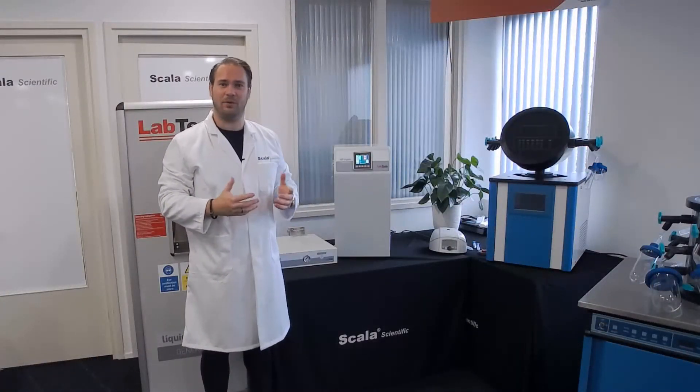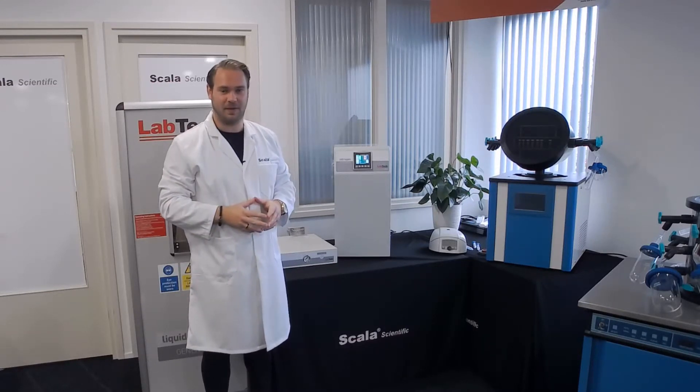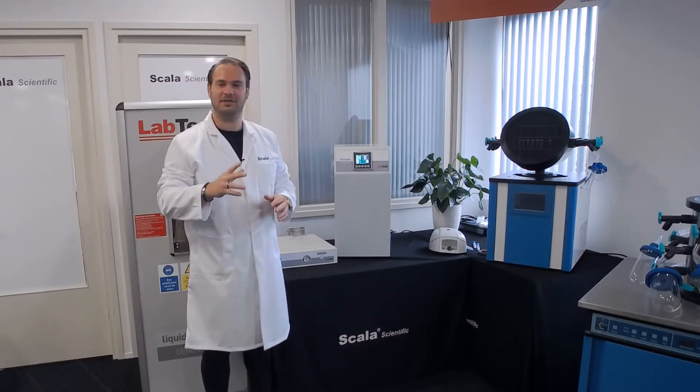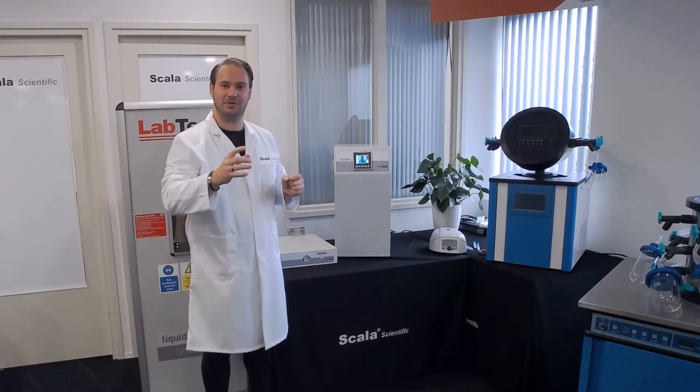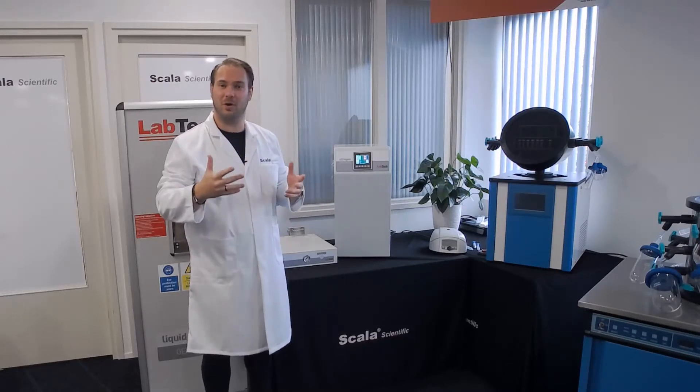This particular model, the LN1, is the smallest in the series of nitrogen generators. The "1" in LN1 stands for the nitrogen it produces in liters every minute, which it can put out — also called the flow rate.